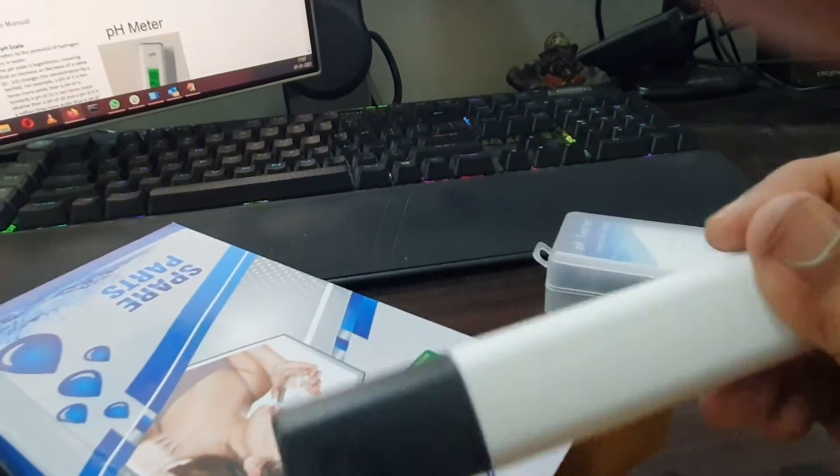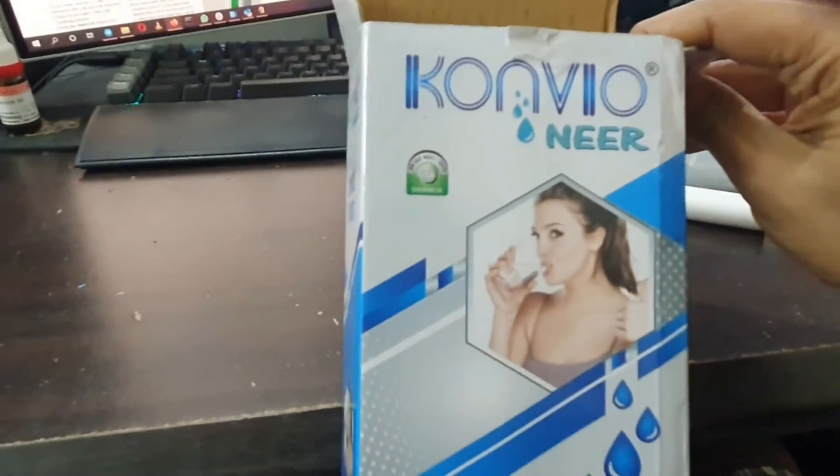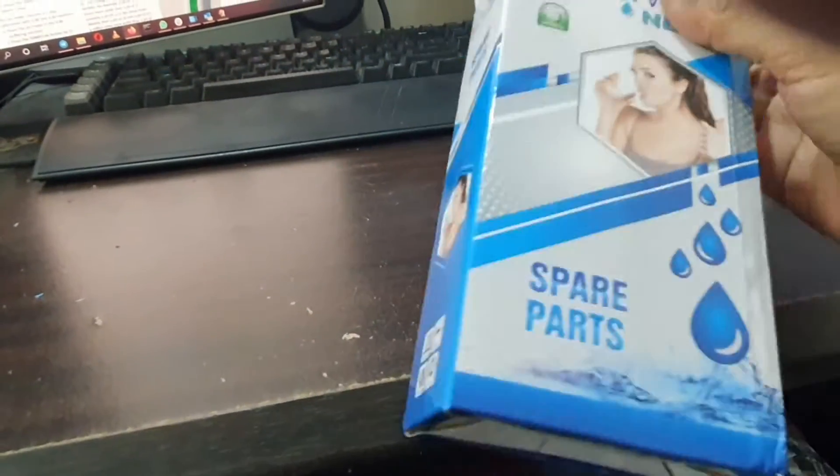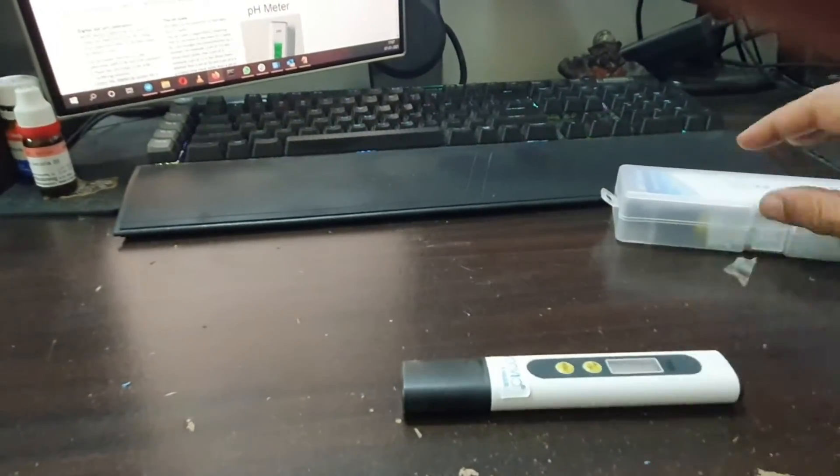Unlike the pH testing kit which comes with a pretty good box, the TDS meter is just simple — just the meter, nothing else, nothing fancy. The front of the box mentions gold drinking water. This is supposed to be pre-calibrated and ready to use, so we'll see how it goes.